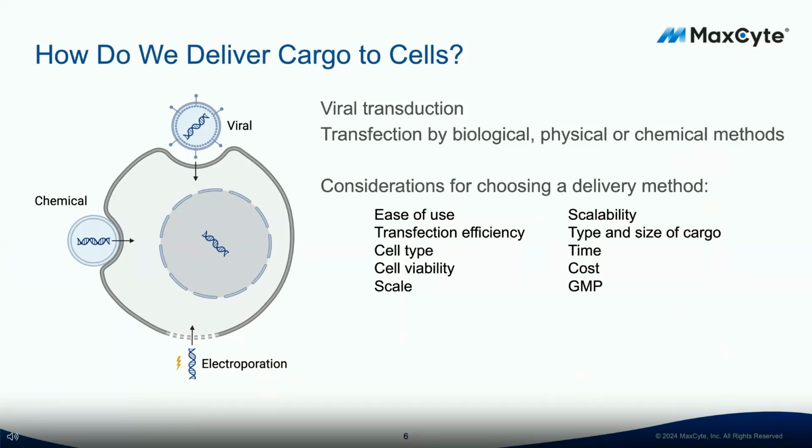The type of cargo and the size of the cargo does determine success of cell engineering, and of course the time it takes, not just from electroporating or transfecting cells or introducing the molecule, but to reach your end goal. And ultimately that determines the cost of your whole project, and there could be GMP considerations later down the road.